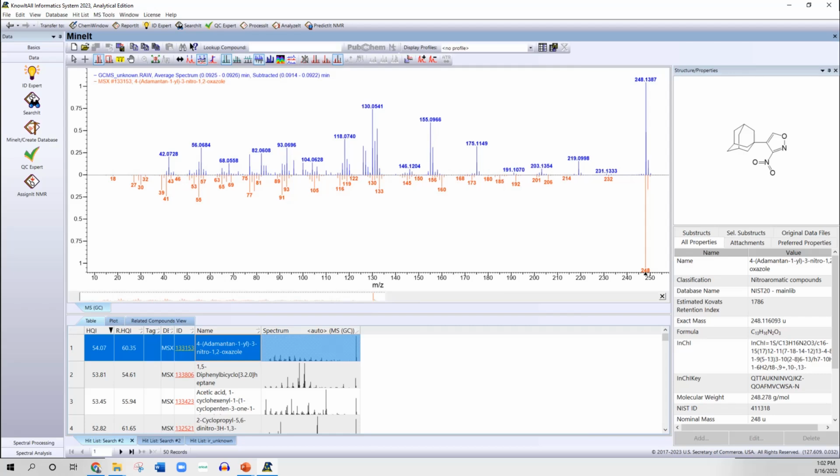Before I show you the results that you would have gotten in the adaptive mass spec search for this unknown, I want to look at the more standard identity search that one would normally employ before the adaptive search was available. You can see on the top we have the EI mass spectrum of the unknown, and in the bottom we have the reflection of it showing the best hit that it got from the identity search. And you'll notice that it's this compound up in the right corner.